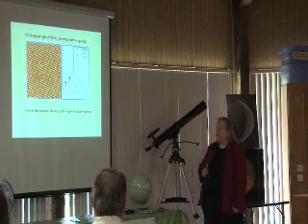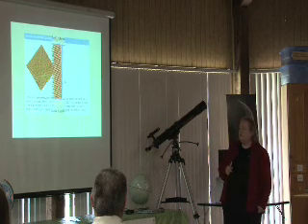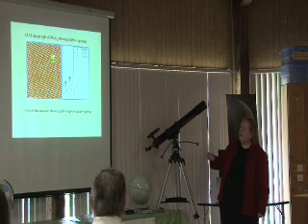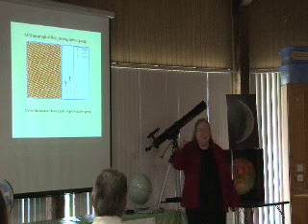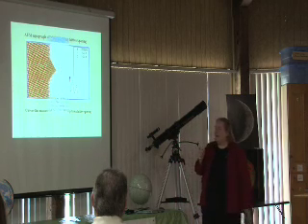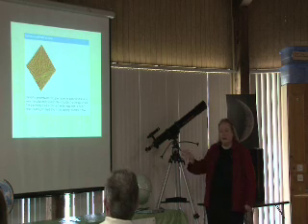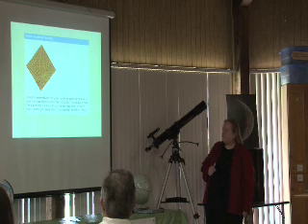This is something called MoS2, moly disulfide. It's an important lubricant in industry. And the spacing of individual moly and sulfur atoms, you can measure the spacing between different atoms, is used to calibrate the microscope. They're so regular and so well defined that you can look at surfaces and use an atomic lattice to calibrate your instrument and to know what sizes things are.